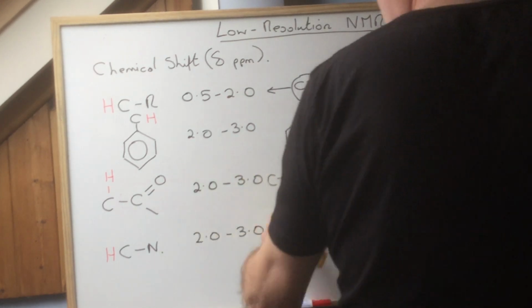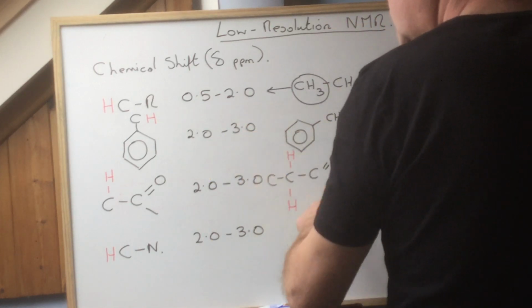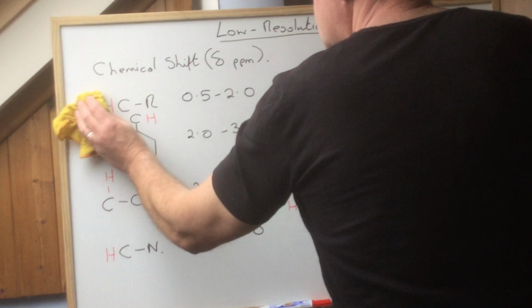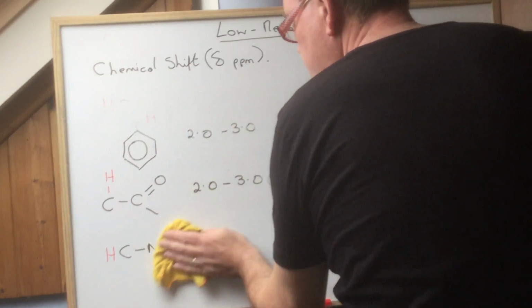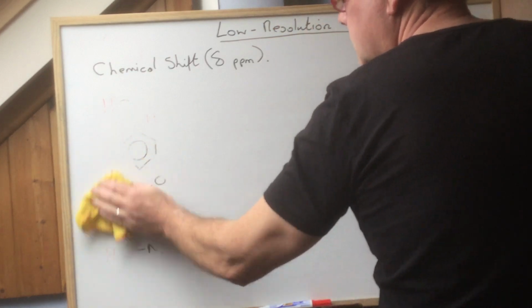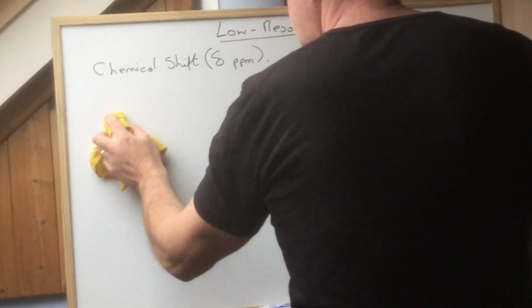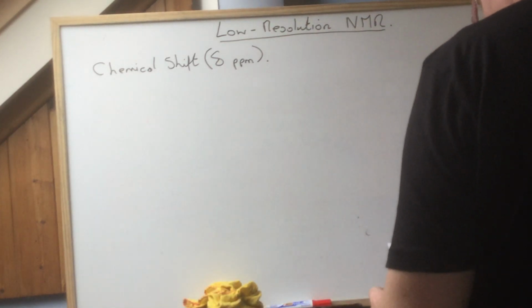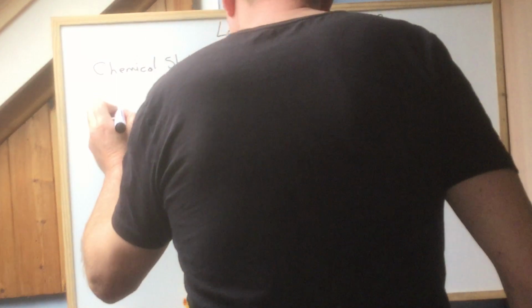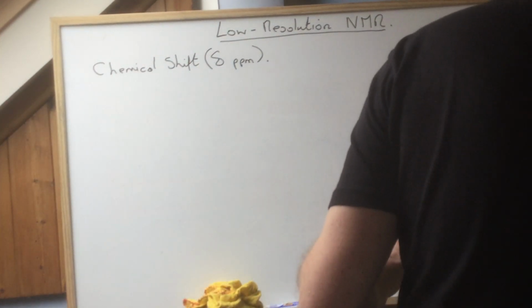Right, now we rub these out. So that 2 to 3 area could be all sorts of possibilities. All sorts. Once you learn how to use these, it's not a problem. Right, next. Now there's a group here, HCO.